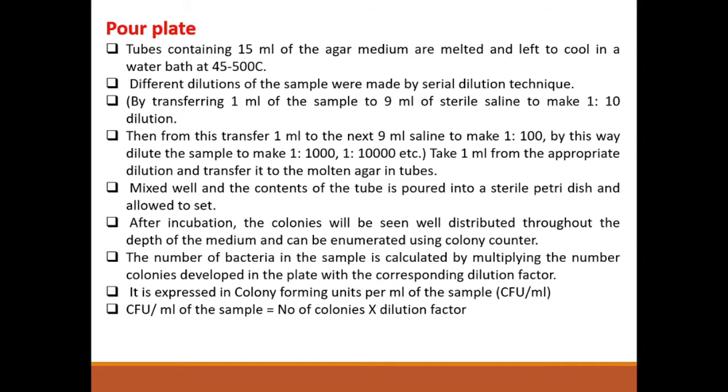For isolation also this method can be used. For isolating bacteria this method can be used, but mostly this method is used for enumeration of microorganisms present in a sample. Then we will check how we can do this. In your higher semesters you will have the practical sessions of PourPlate. At that time you will understand more, or you will do this by yourself.